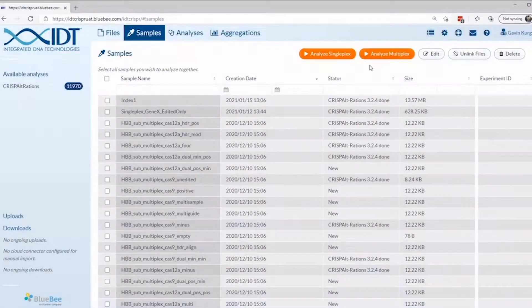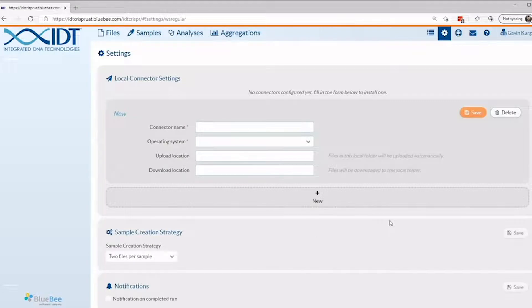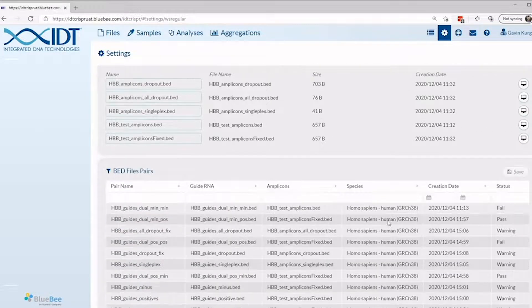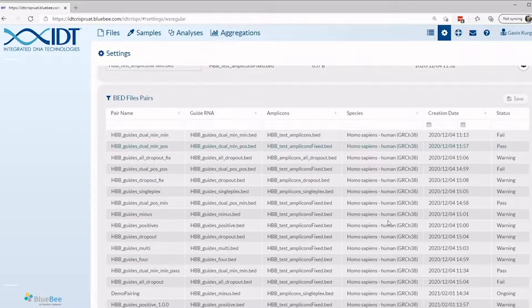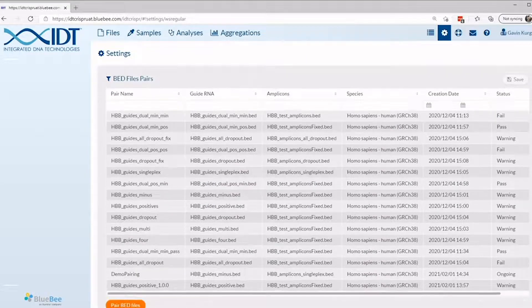To make the most of the RAMP-C CRISPR analysis tool, we'll show you how to quality control check multiplex file inputs. Let's dive into what happens after you upload your bed files for multiplex analysis. Navigate to the settings page to the bed files pairs section. This is how to QC check your inputs to make sure they can successfully be used for analysis.